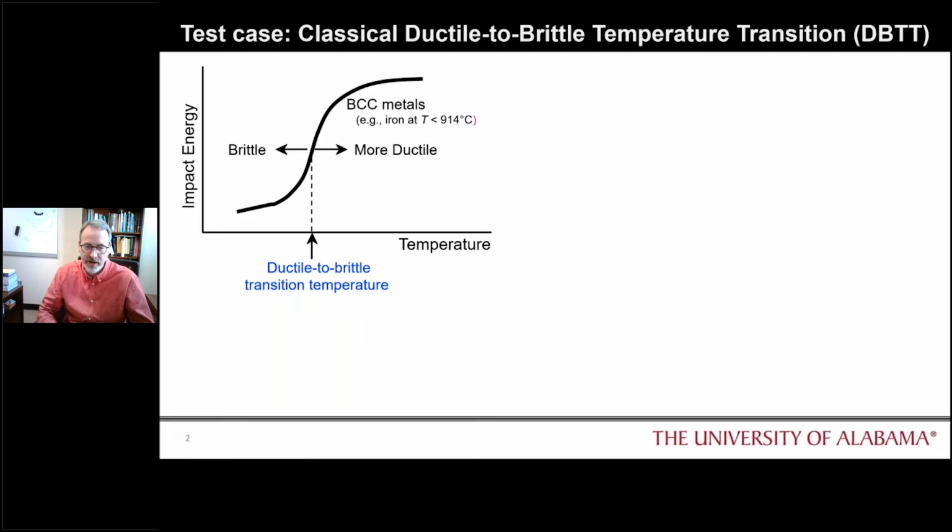But when you add carbon into steel, you also precipitate out a cementite phase, a ceramic phase called Fe3C, that produces a lath-like structure called pearlite. That's shown here in the bottom left image, a micrograph of that lath-like structure. The volume fraction of this pearlite phase, which is alpha iron or ferrite and cementite, will be controlled by the carbon concentration. And of course, the spacing that we see is going to be a function of the composition as well as the undercooling the alloy undertook.